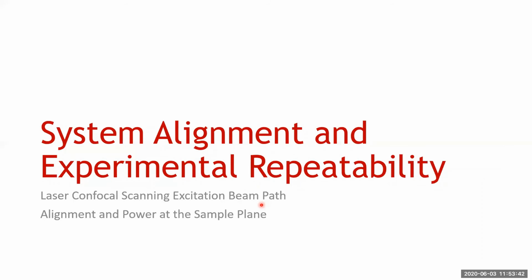Well, if you care about file size, then increasing bit depth, if you're on a microscope that can actually have different bit depths, then the higher the bit depth, obviously there's more digital information, so your file size will increase quite a bit. That being said, you won't see any increase or decrease in speed. You have no speed changes because it's just digitizing the data.